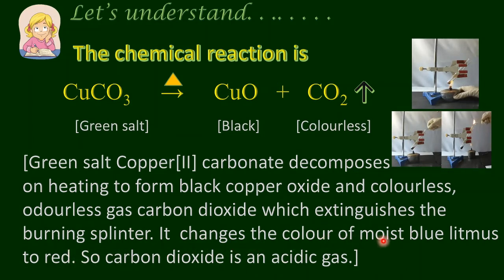It changes the color of moist blue litmus to red. So, carbon dioxide is an acidic gas.